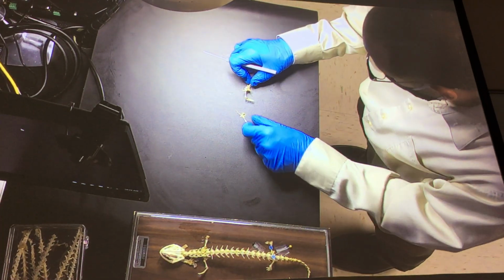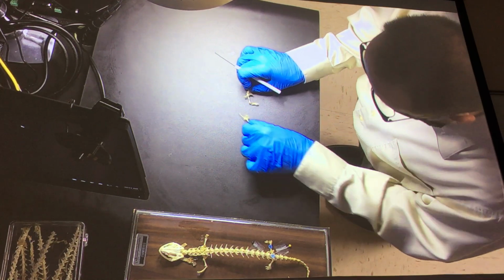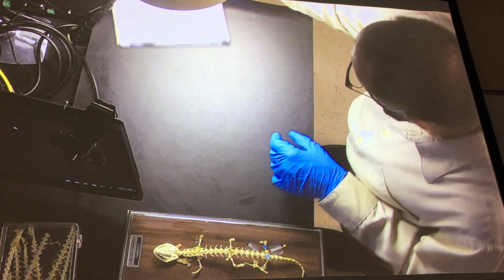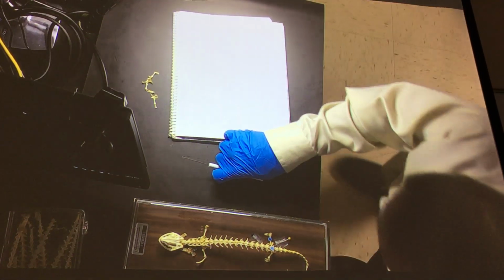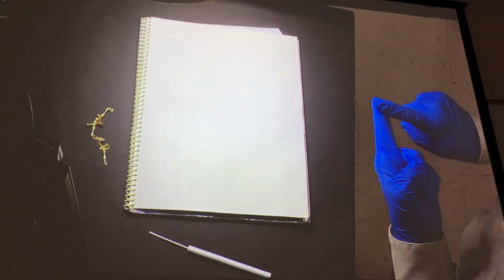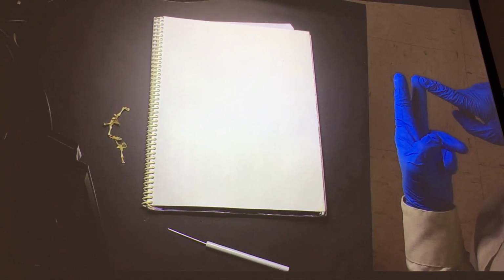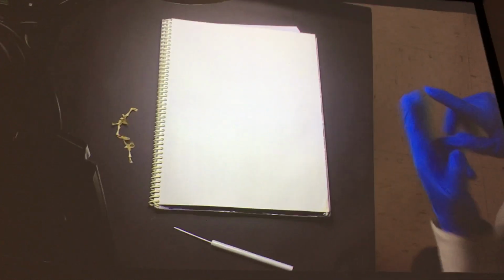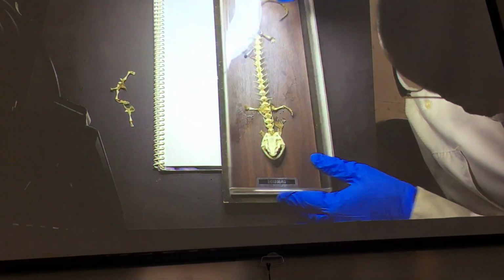to, but that's only going to do so much because they're all damaged, which is why I don't use them on exams anymore. Well, let's look at them in situ. Now, one of the things is you're trying to find these to study. Pretty much for these mud puppies, either the pectoral girdle is good or the pelvic girdle is good. But there's maybe one animal in the class that both are good, which is why I got two of them here. So, let's go back to our pelvis, since we just were talking about that.